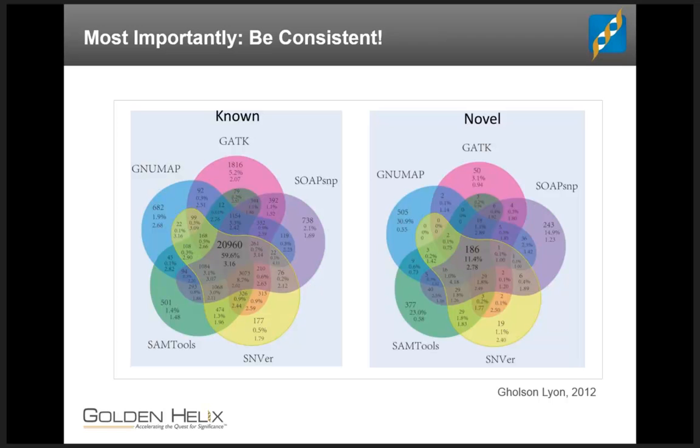We talk to a lot of people here at Golden Helix who come to us looking for analysis tools. I have the opportunity to talk to a lot of them, find out about their study designs and what their needs are. And there's a particular conversation I've had several times. I wish I had $1 for every time I've heard this. But people will say, well, we thought we would just sequence all of our cases and use borrowed controls in the analysis. And, well, now we're sequencing controls. It's something that I've seen over and over.